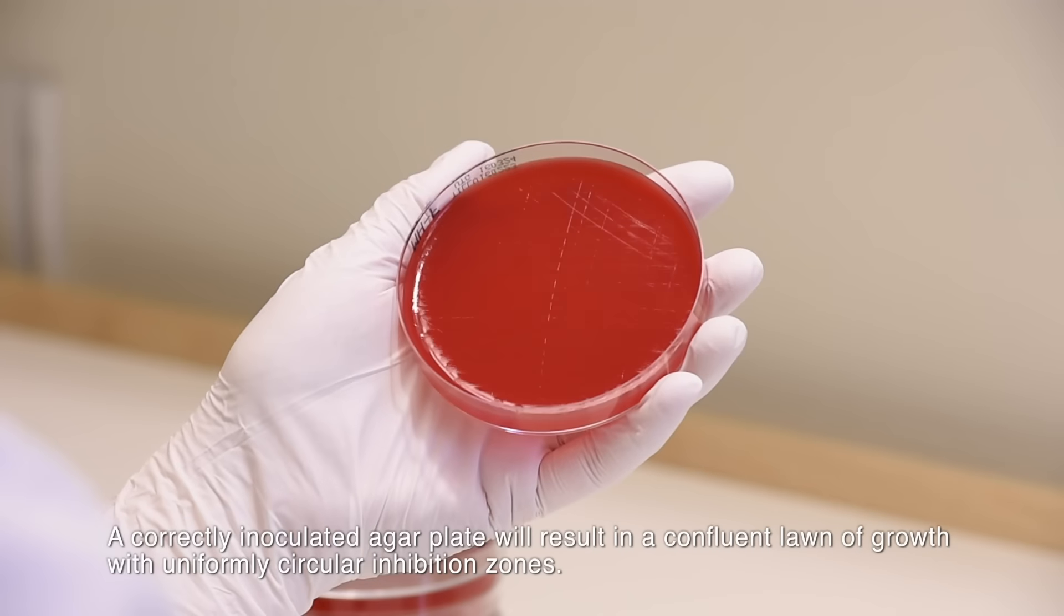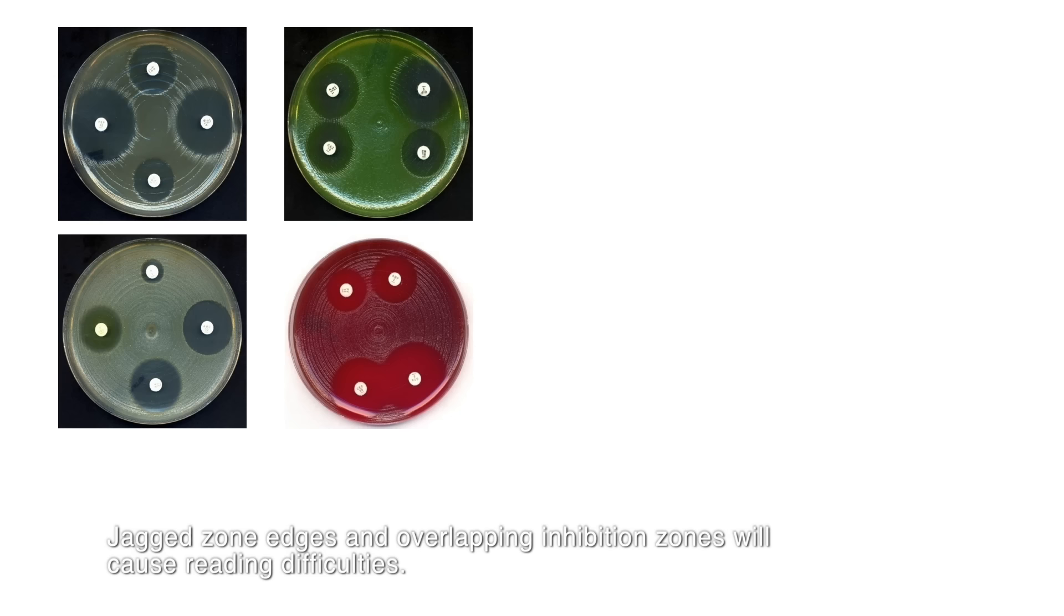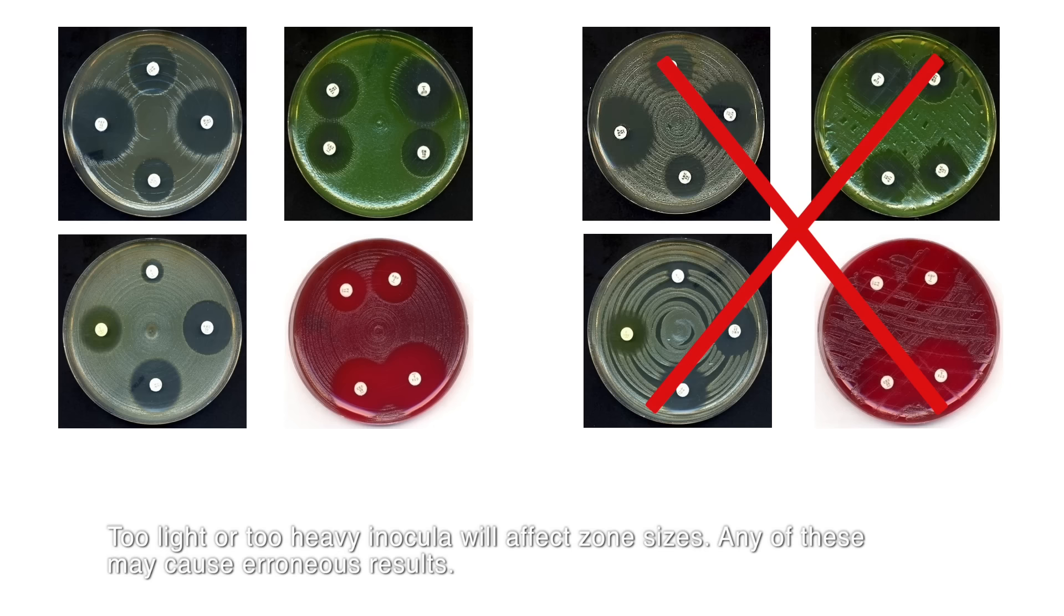A correctly inoculated agar plate will result in a confluent lawn of growth with uniformly circular inhibition zones. Jagged zone edges and overlapping inhibition zones will cause reading difficulties. Too light or too heavy inocula will affect zone sizes. Any of these may cause erroneous results.